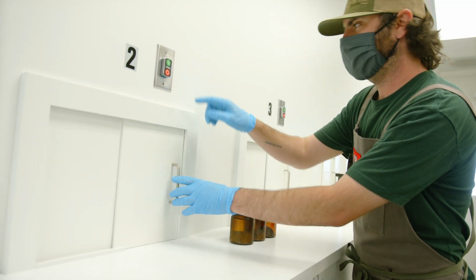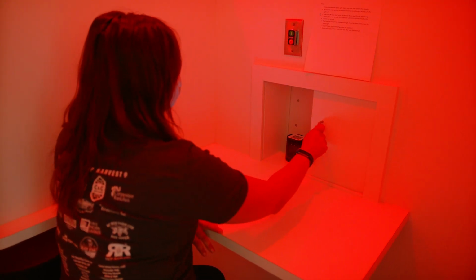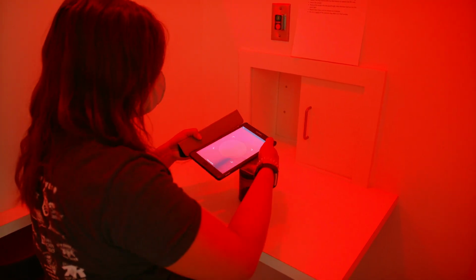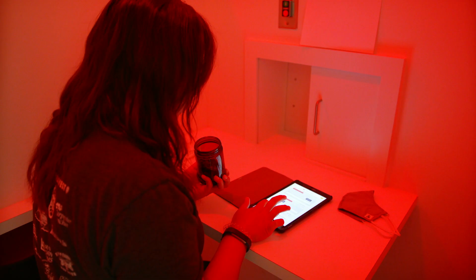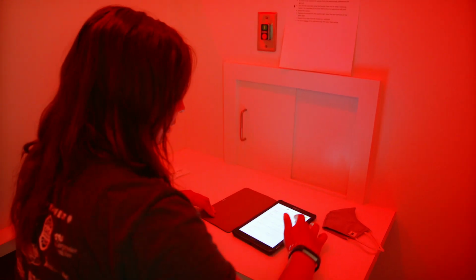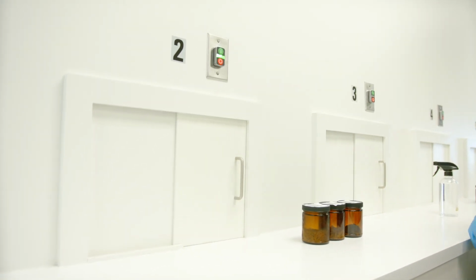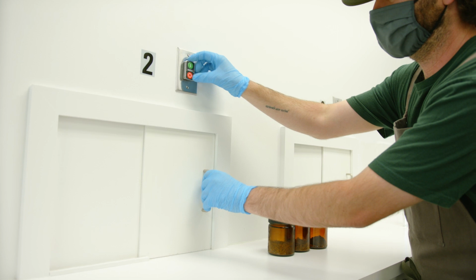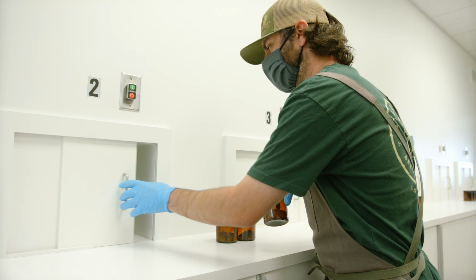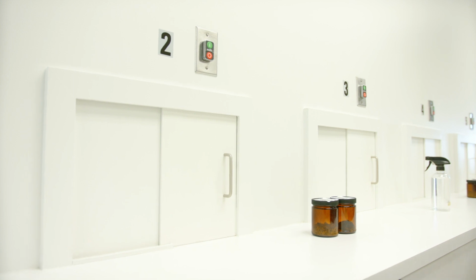So he puts it into the passing zone, he turns on the light. That tells the panelist on the other side that there is a sample ready for them to assess. And when the light goes off, we know that the panelist has picked up the sample and they are currently assessing it. So now once the panelist is finished assessing the sample, they'll go ahead and turn the light back on to indicate that they've placed their sample in the passing zone and that they're finished with it. So Kevin goes ahead and takes that sample out and replaces it with the panelist's next sample, turning the light on to alert them that there is now a new sample in the passing zone.